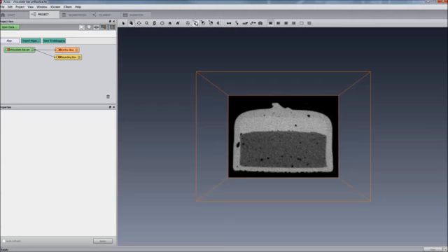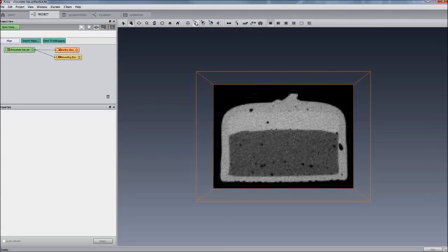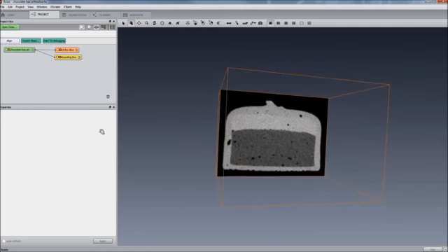These buttons can be combined with the Shift key to align the view on the opposite side of the same axis. These buttons do not lock the view. The user is free to rotate the object again.